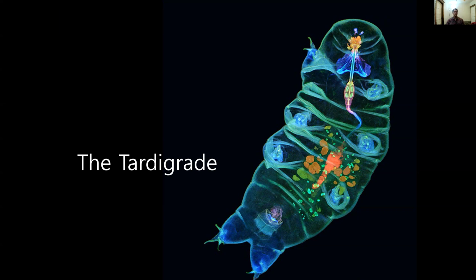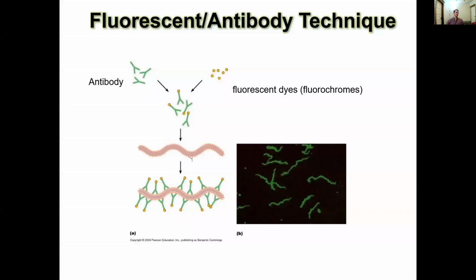Oh, a lot of tongue twisters there. So these fluorescent dyes allowed them to see the tardigrade's entire digestive tract, including the mouth parts, and then the stomach filled with food. This is really, really interesting. Remember, the tardigrade was that really tough organism we discussed, the one that can go into space and come back and still be okay. The water bear, moss piglet, yeah.